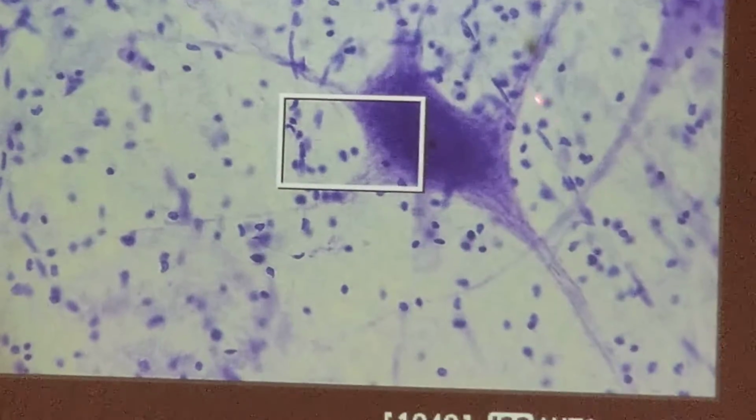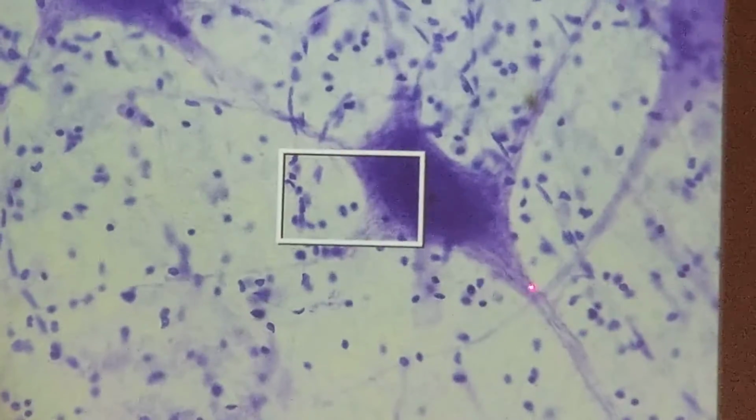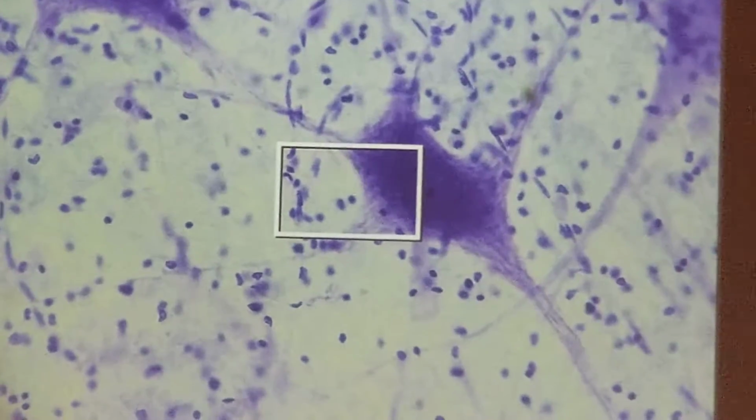So just put axon or dendrite. Don't label all of them, just label one of them. That's an axon slash dendrite right there. That's the cell body, and that's nervous tissue. Be able to recognize what it looks like. Pretty unique. I think it's pretty easy to identify. I'll just use it a couple times.